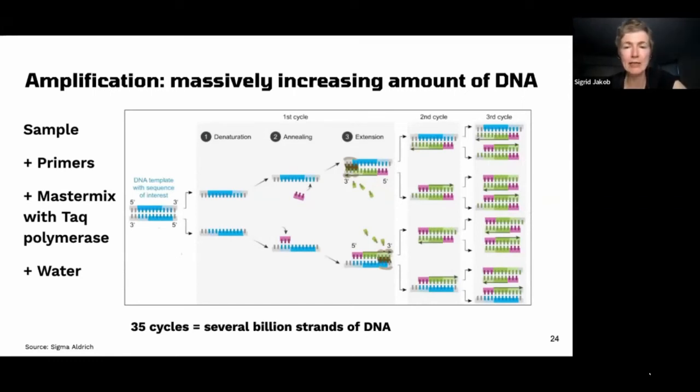And then you cool it down. And you put a bunch of primers into the mix. Primers are tiny little bits of DNA. Because what you're not trying to do is copy the whole string of DNA, all 47 million sequences. That would be crazy, because you're only interested in a tiny little bit of it. So what a primer does, it attaches to the front and to the back of the ITS regions, the only thing you're interested in.